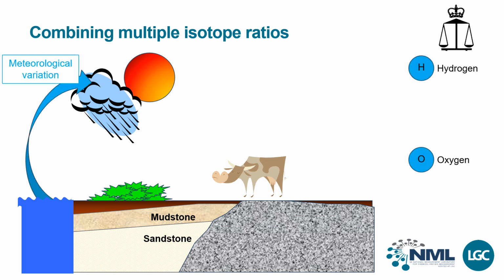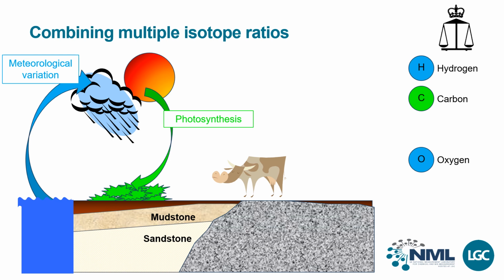When creating such a database, it is important to include parameters or variables that are expected to vary between locations. The fractionation processes previously examined for hydrogen and oxygen isotope composition of precipitation varies systematically across the globe, with gradients from coast to inland areas and higher altitudes and latitudes. Different photosynthetic pathways leave characteristic carbon isotope signatures in plant materials used for cattle diets. Fertilizers, both synthetic or natural slurry, can impact on the nitrogen isotope composition of plant materials used in cattle diets.